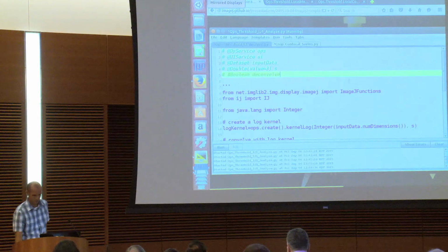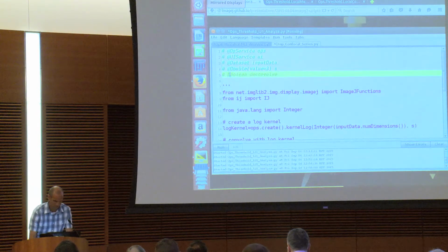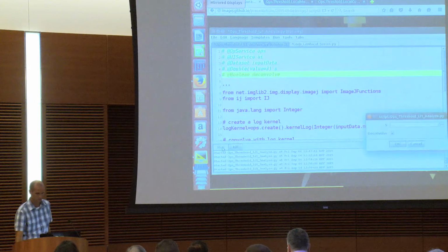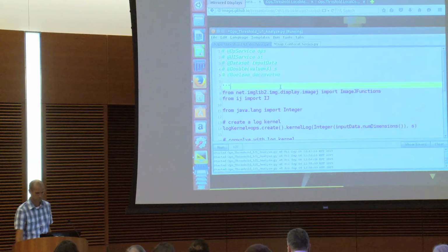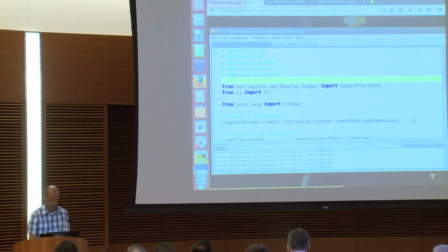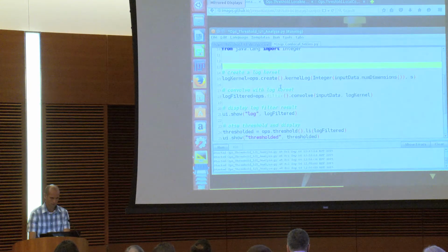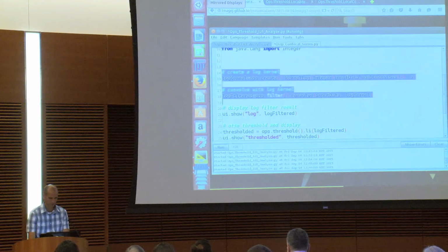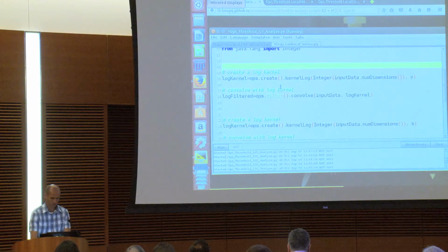Deconvolve. So if I run this, yeah, I'm making typos. So I get a nice little checkbox, which allows me to either deconvolve or not. So what I'm going to do is copy this code, because the deconvolution is going to be really close to that format.